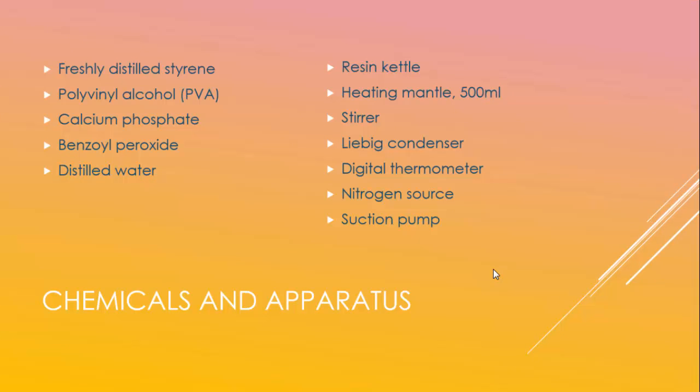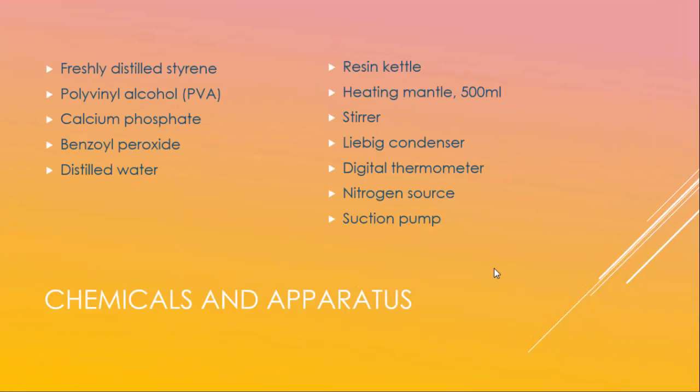The following equipment and chemicals will be the ones that you'll be using, so check first before you proceed to the start of the reaction.